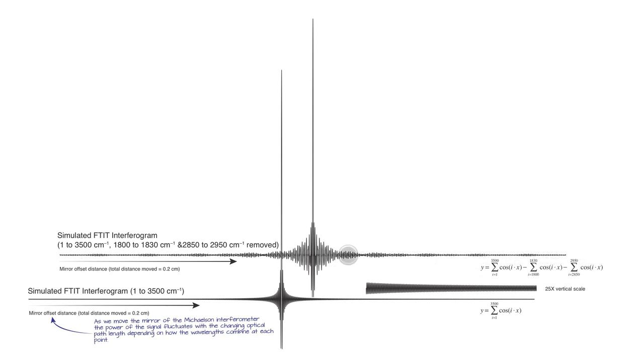Something is up. I can use a technique called the Fourier transform, which will tell me every single frequency that's in that wave. It will give me a list. I can basically use the Fourier transform to ask, is this frequency present? And if it is, it'll give me a number, which is proportional to the intensity of that signal in its contribution to this whole pattern here. And so if that particular wavelength is there, I get a number. If that particular wavelength is not there, I get 0. So there it is sort of blown up. I can see this information here. Compare it to this. There's information there.